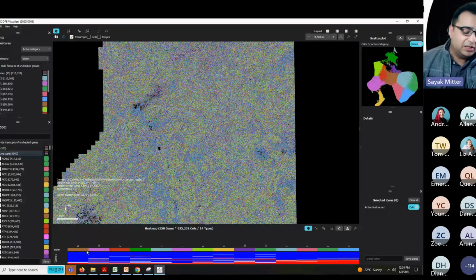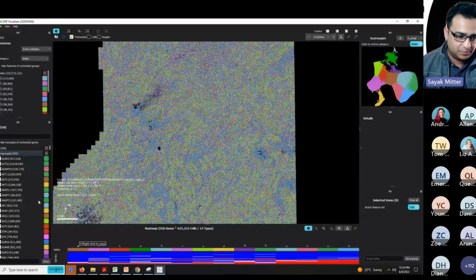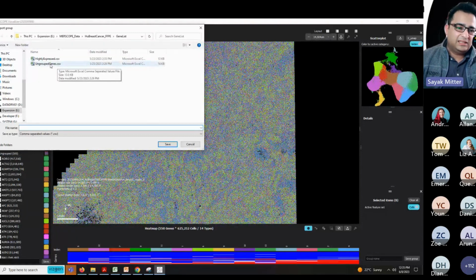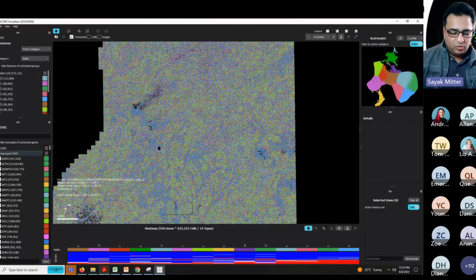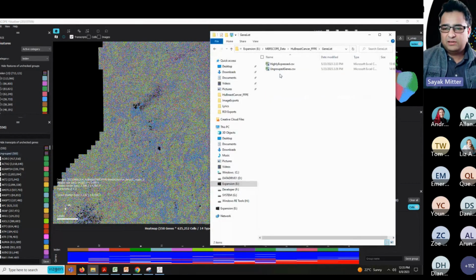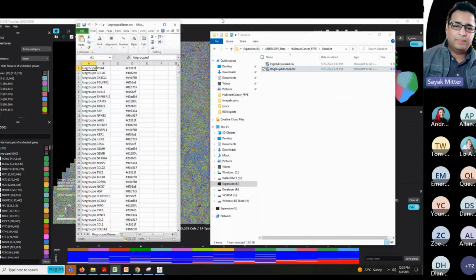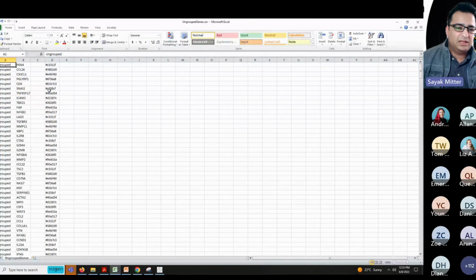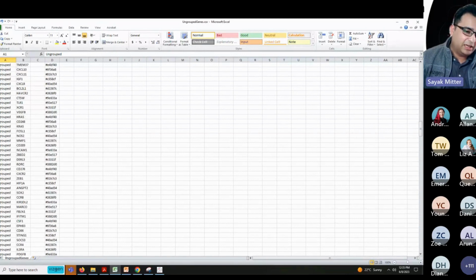I find it much easier to do it outside the software, export it, and import it back into the software. So I'm going to quickly show that workflow. When I right click on this, you can export the genes out. I have already exported it and named it the ungrouped CSV. Let's quickly look at where that is and how we can manipulate it. I have it saved under this gene list. If I double click and open this, here I have the different gene names, all listed with the color map based on whatever display colors are being used. And right now everything says ungrouped.